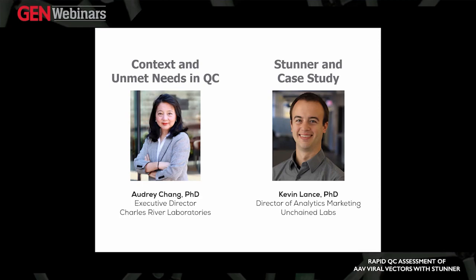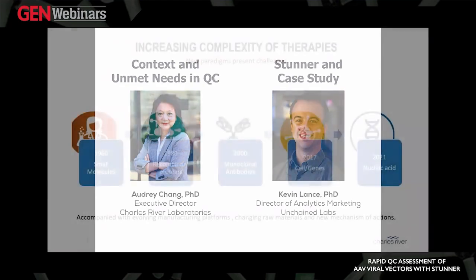Then I'll pick up the ball and introduce Stunner, a tool that addresses several of those unmet needs, and go into a few case studies examining the details of a recently published paper in Vigene Biosciences and walk through some additional data that's only seen here. And now I'll hand it off to Audrey.